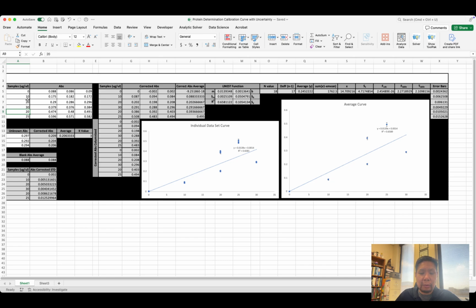So you can put whatever concentrations you want here. And again, where do you get those numbers? You get them based on whatever assay you're doing, whatever calibration curve you're trying to create. If you're doing a Bradford assay, then you're going to use your concentrations for your Bradford assay, as far as whatever protein you're using, or a Lowry assay, they will all be different. Or just doing absorbance at 280, A280, they'll all be different depending on what concentration and what protein you have. If you're starting blind, I would just go 0 to 25 in increments of 5. But then it's trial and error based on the assay you're doing and the protein you're going to be trying to quantify using this calibration curve.